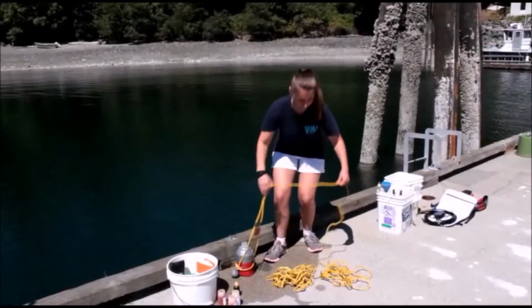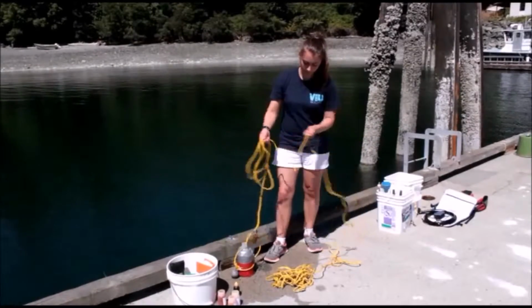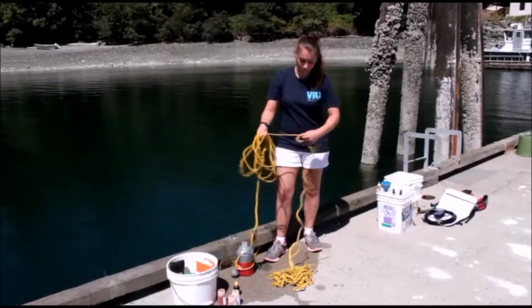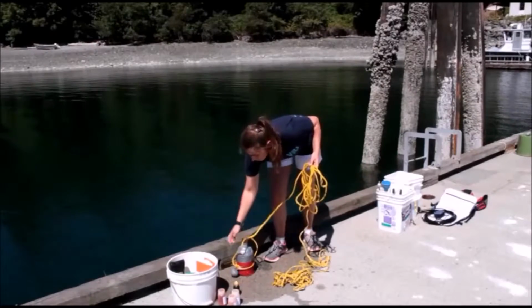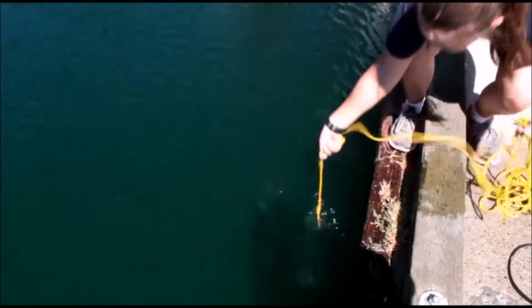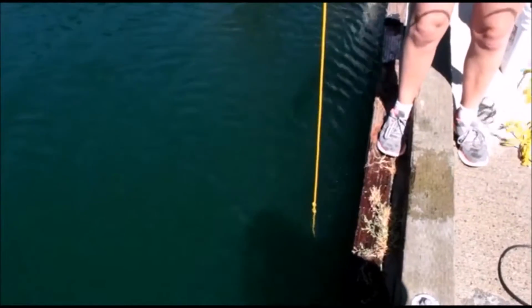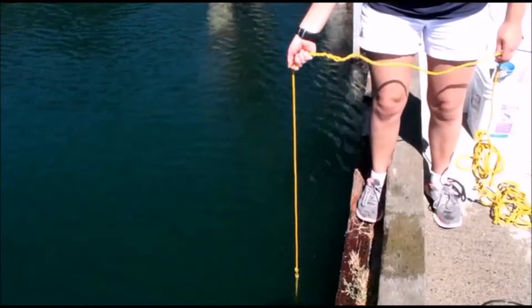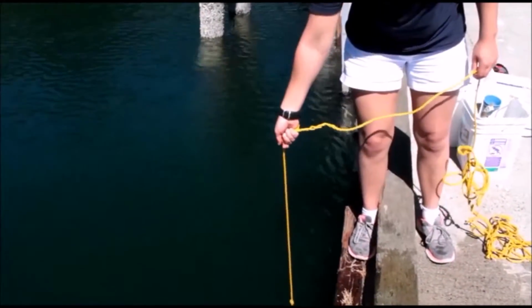So repeat the same steps for the other sampling depths. Find the mark for your sample depth. There's the knots for 5 meters. Cork the bottle firmly and lower it into the water. There you go, there's your knots again, right at the surface for 5 meters. Wait a few seconds and then give it a tug. Cork pops out. Wait a few seconds for it to fill.